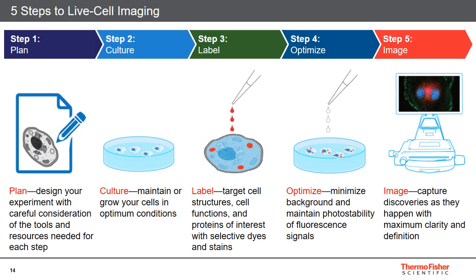So that's really just one of the key parameters that needs to be optimized. And again, oftentimes this is something that we will spend a lot of time performing the optimization on the front end, but of course we're not really able to do this with every single cell type out there. So it is something that sometimes needs to be performed on a cell type specific basis, but we'll at least provide general guidelines on concentrations and fold dilutions on where to start.